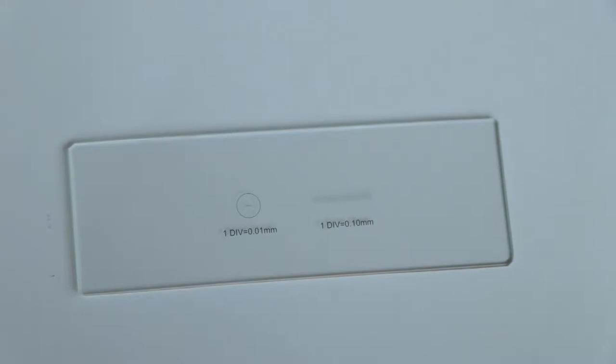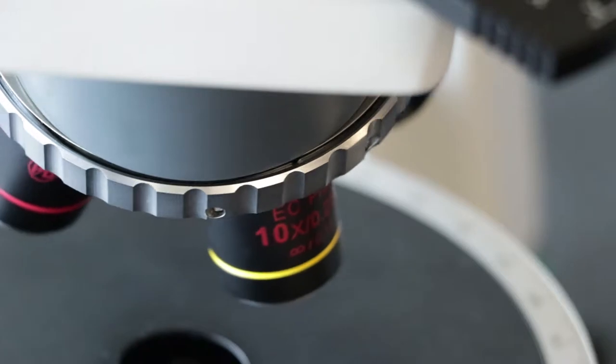The micrometer slide is typically used to calibrate the eyepiece graticule, but we can also use it to measure the width of the field of view for each objective.